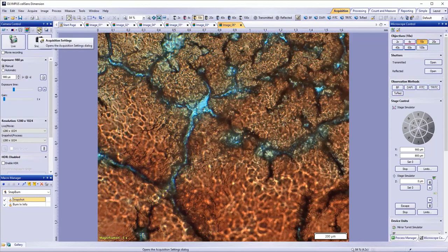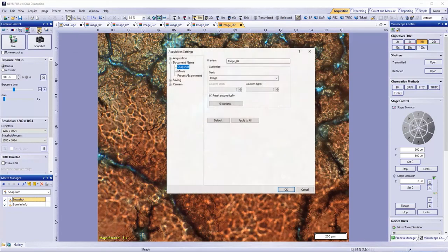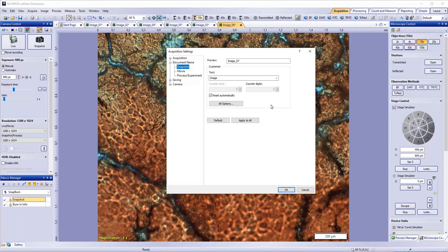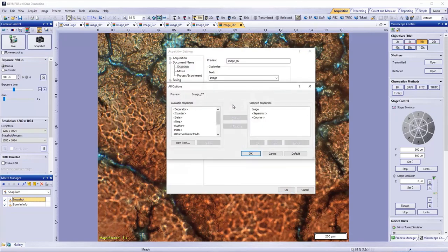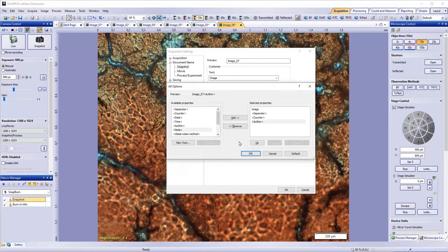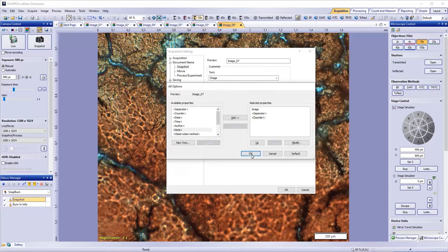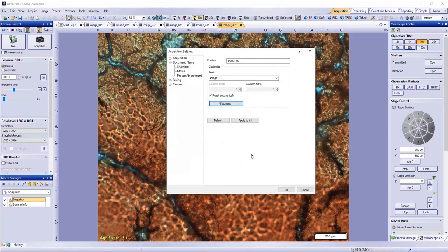Next, I'll show you how to select other data that can be added to the image name. Go to All Options, select the data that you would like to include from the list on the left, and click the Add button. To remove these data, select it from the list on the right, and hit the Remove button. The same naming functionality is available for movies, processes, and experiments.